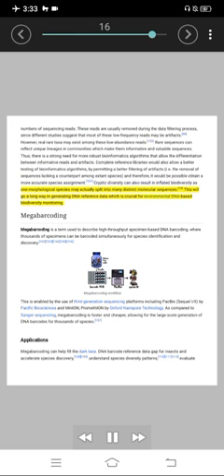This will go a long way in generating DNA reference data, which is crucial for environmental DNA-based biodiversity monitoring. Megabarcoding. Megabarcoding is a term used to describe high-throughput specimen-based DNA barcoding, where thousands of specimens can be barcoded simultaneously for species identification and discovery. Megabarcoding workflow. This is enabled by the use of third-generation sequencing platforms including PacBio Sequel II by Pacific Biosciences and MinION, PromethION by Oxford Nanopore Technologies.